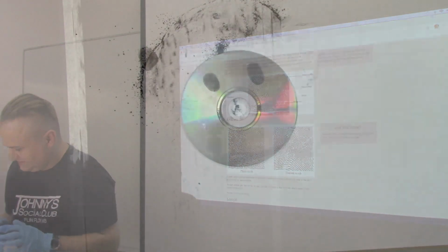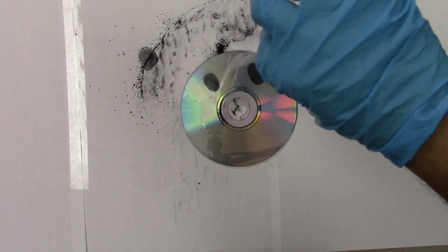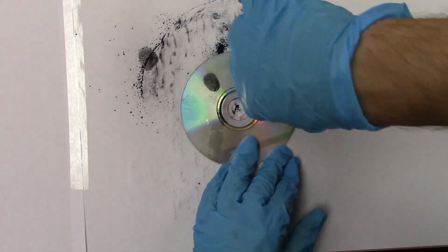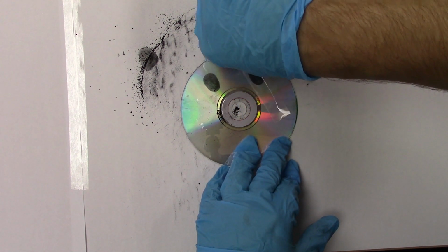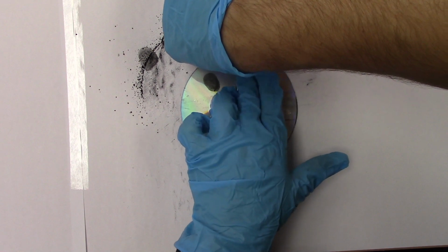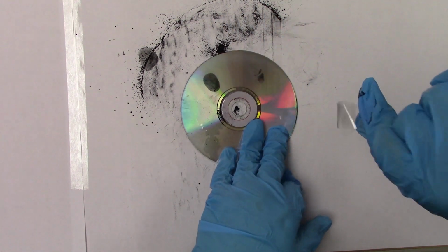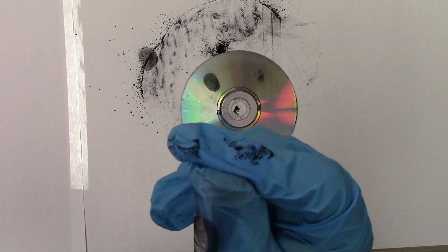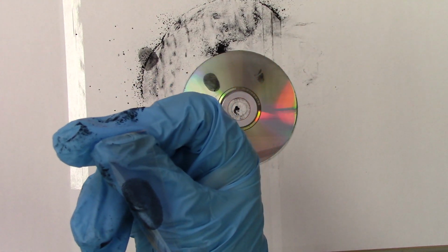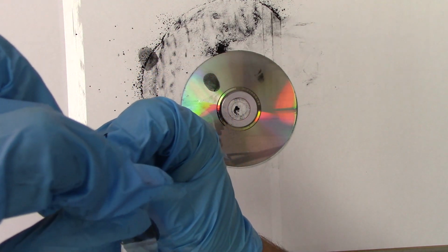All right. So, I'm going to take, this is going to be hard with the gloves, apologies in advance. I'll take one piece of tape I've got right here, and I'm going to put it over the print, nice and clean. I'll make sure I get this print captured. There we go. I'm going to press it down on the print. I'm going to lift it off, and look what happens. I've stolen the print onto this tape. However, this is not good with gloves, but I could take another piece of tape and put it on the inside and cover it up.